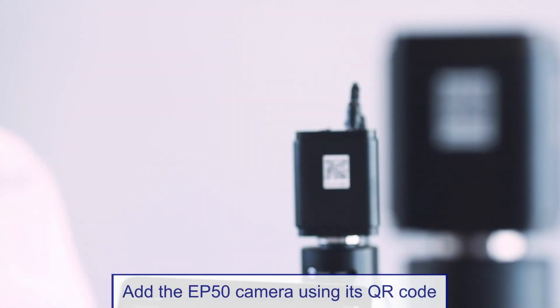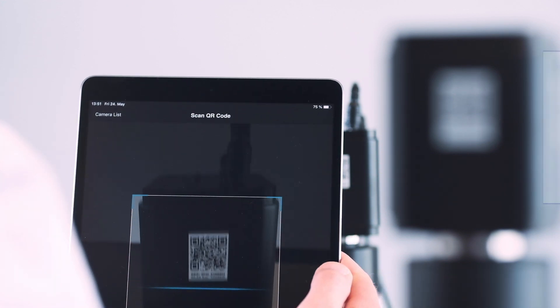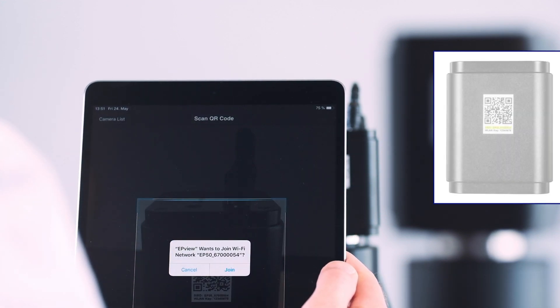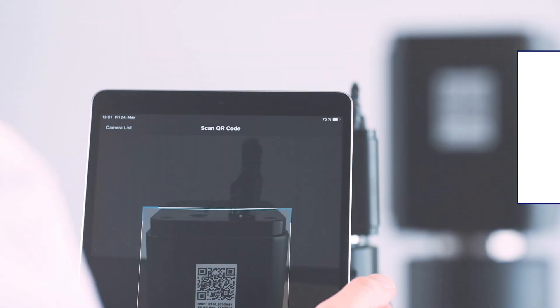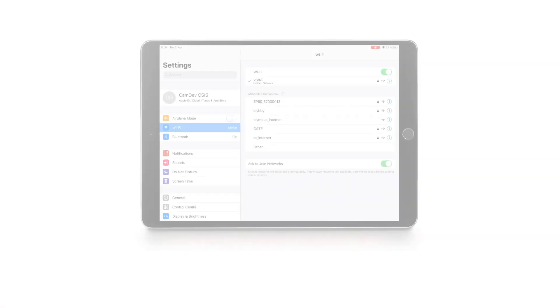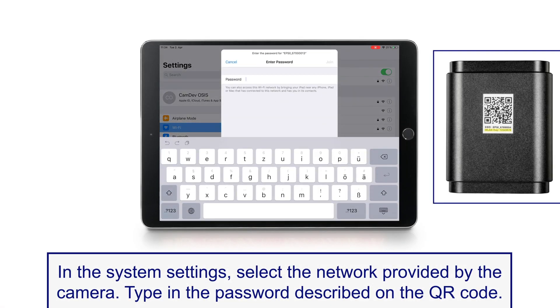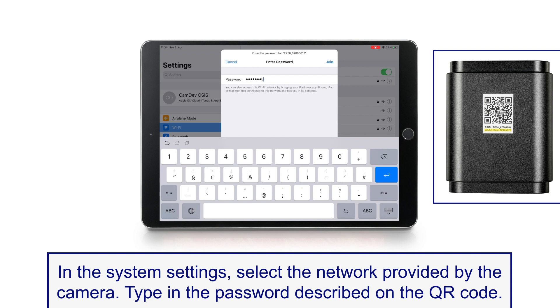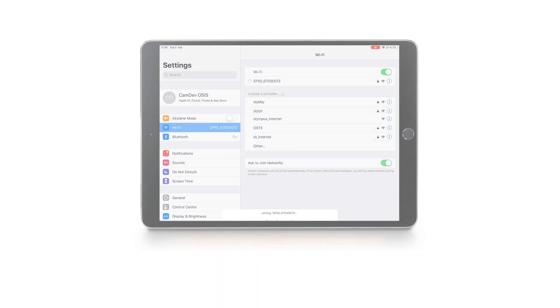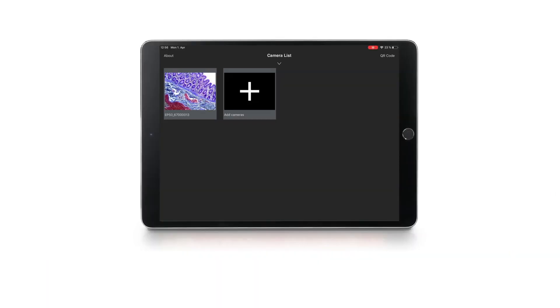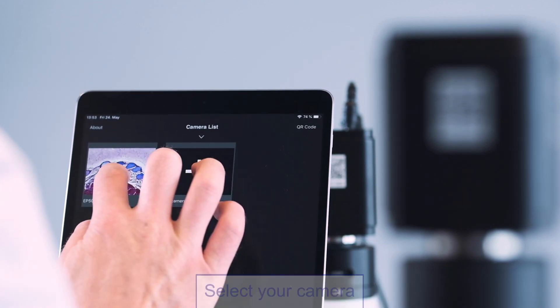Connect to your EP50 camera by scanning the QR code with your mobile device using the QR scanner in the EP View app, or manually by selecting the camera's wireless network. Your camera should now appear in the camera list. Select it by clicking or tapping the thumbnail.